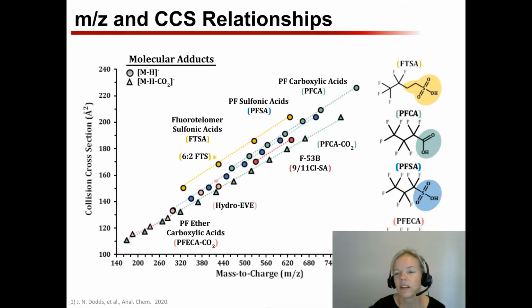So then we started looking at the different subclasses, and we could actually see differences in the subclasses of the PFAS. So if we were looking for specific contamination sites, we could actually tell you what subclass the molecules were coming from. And so this made us really excited.